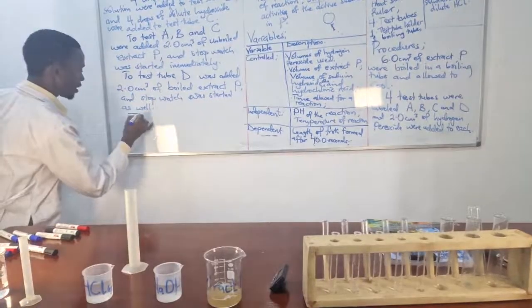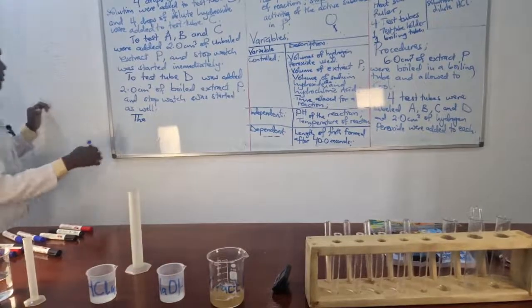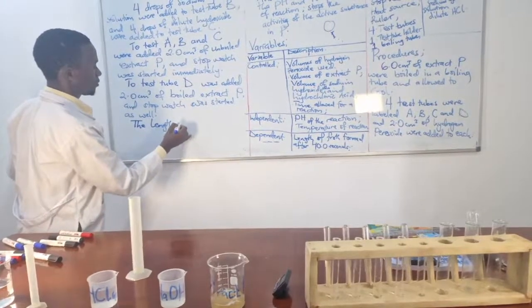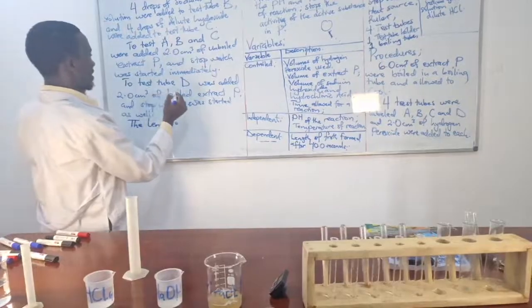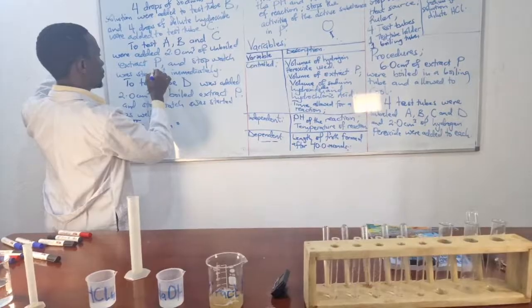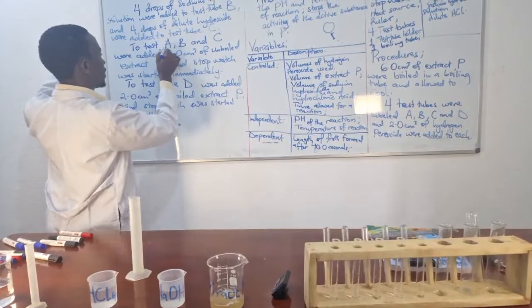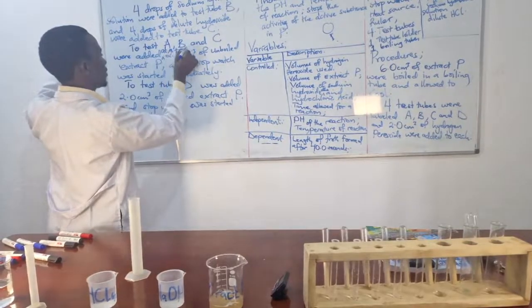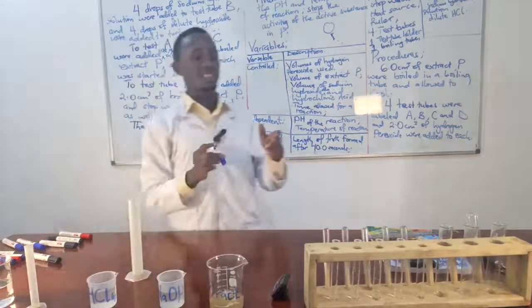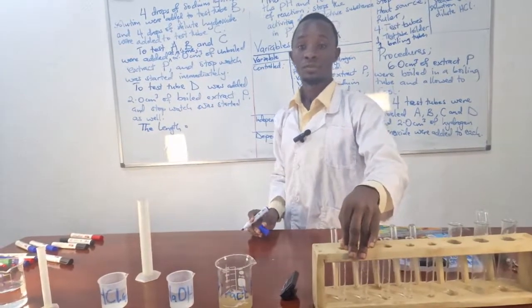And we cannot forget that we are measuring the observation, the dependent variables now being brought in. Let's bring in time here. Do you know why we are bringing in time? We are going to handle each test tube at its own space of time.